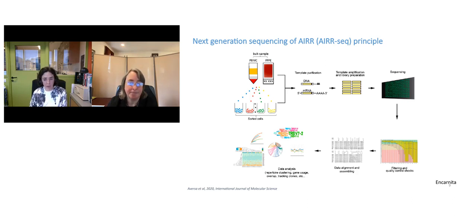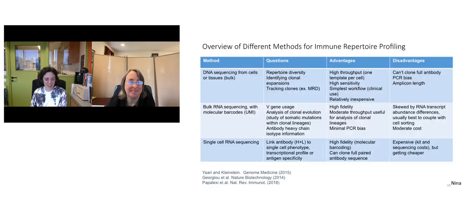Then there are different steps, once the sequencing is done, to check the quality of the sequencing output, whether the sequencing worked or not, and we will show you some examples of this. And once you apply this kind of first layer of QC, you can start analyzing your data. But as Nina is going to introduce afterwards, you'll see that in between the step of sequencing and the step of analyzing, there are many steps to go through before getting your results. So Nina?